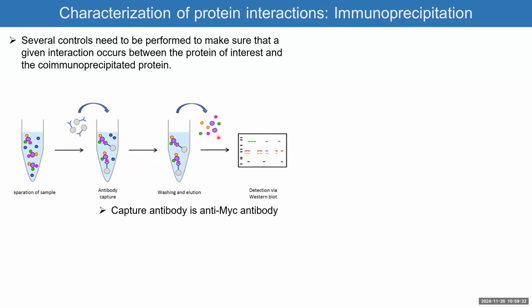So now when you elute the proteins, you will have your antibody, you have the protein that you are targeting, which is the right antigen or the epitope you are targeting. And then at the same time, you pull down other proteins, the green, this larger one, and this yellow. So these are binding partners of your protein. So you can detect them.